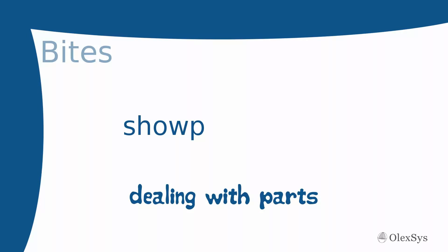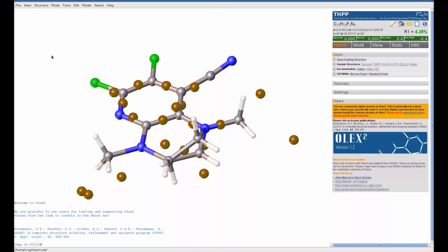If you're working with disorder, you often want to hide it while refining the structure to help model it. When you produce your final pictures, you want to show either one component, the other components, or none of the disorder in your structure, especially if it's a disordered solvent.